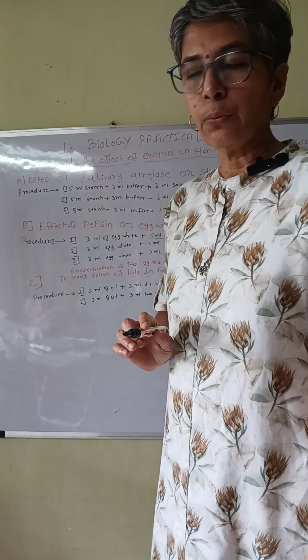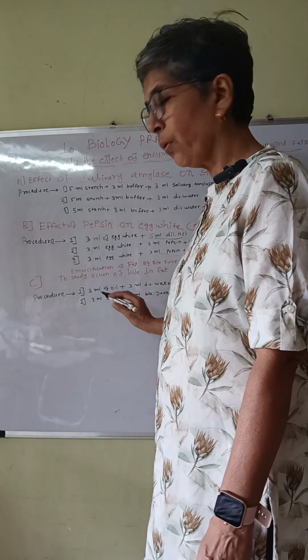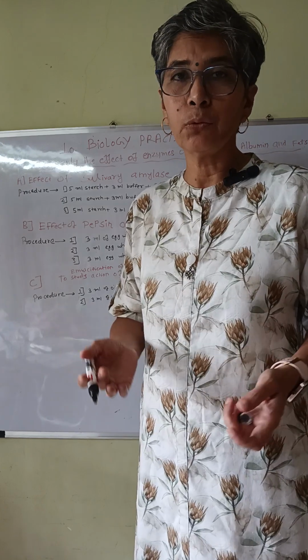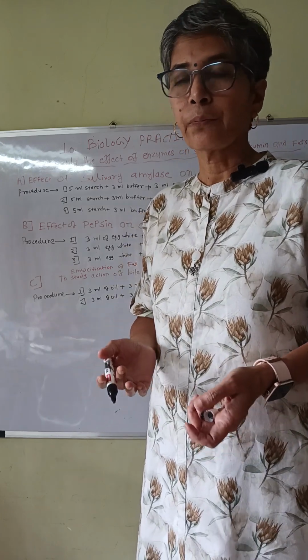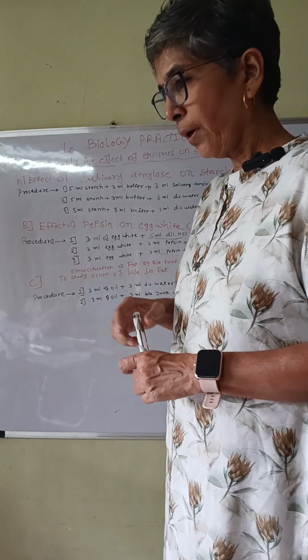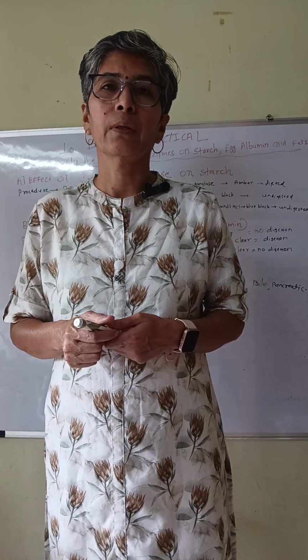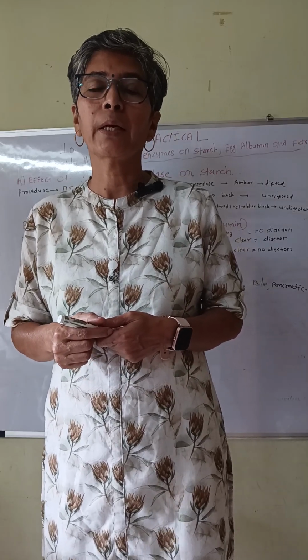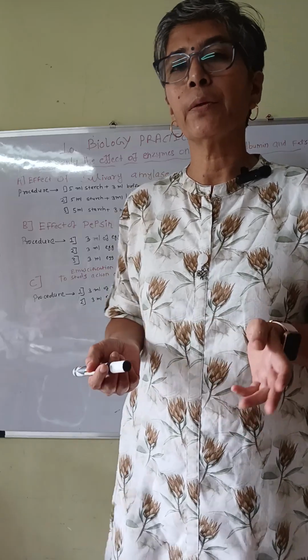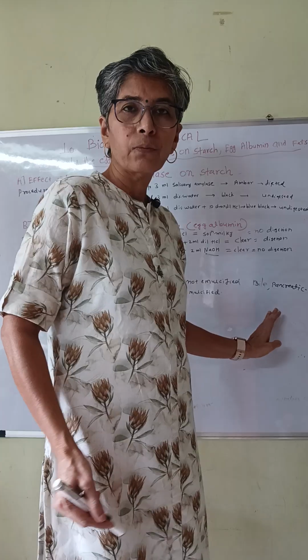In test tube number 2, we have already added 3 ml of oil. Okay, then add 3 ml of bile juice. Okay, so after that, shake the test tubes well and see the results and observations. Write your observation in the observation table. Okay. In conclusion, what do we get?